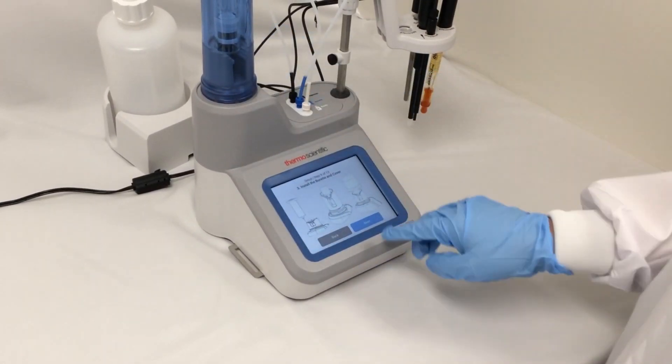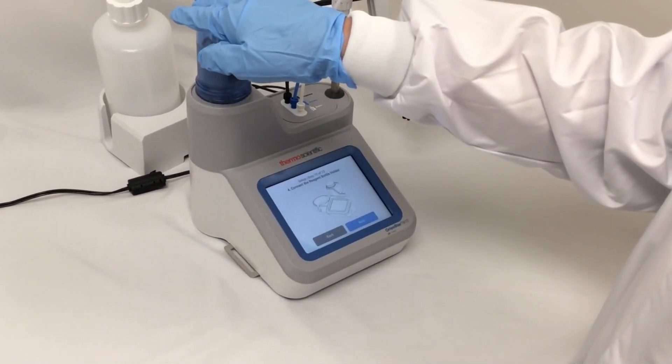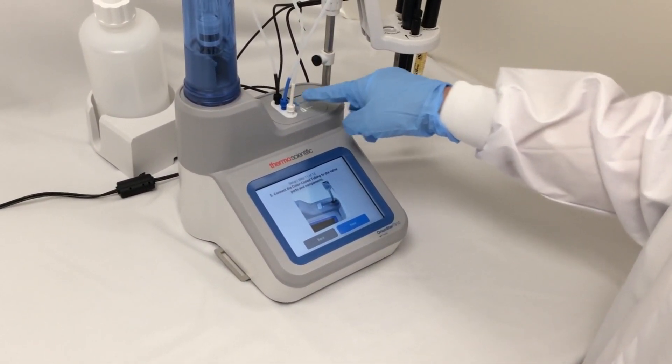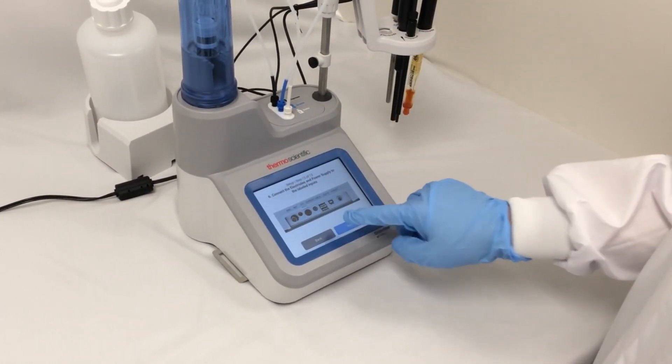I'm going to verify that my burette is securely in place, that my reagent bottle holder — which I've moved to the back of the titrator for space — is positioned, that my ports, which are color coded, have the right tubing connected to them, and that all my electrodes have been connected properly.